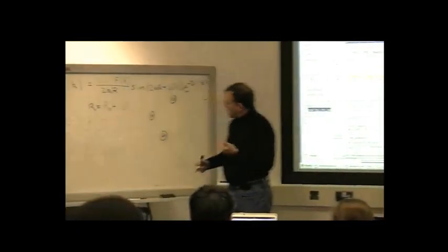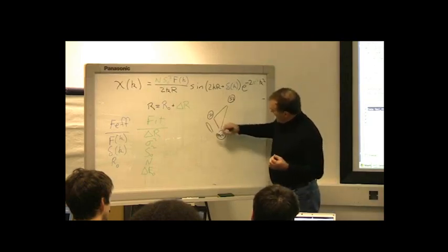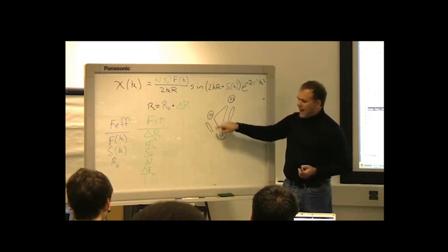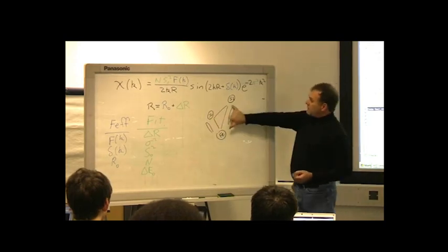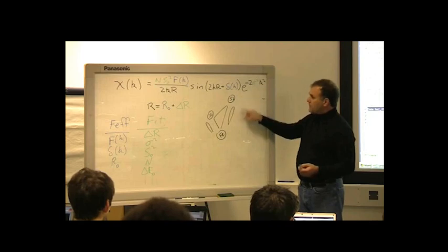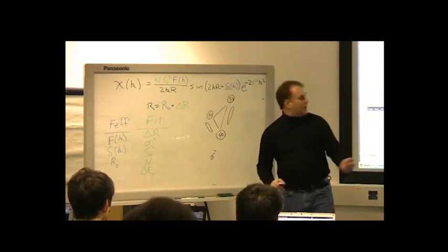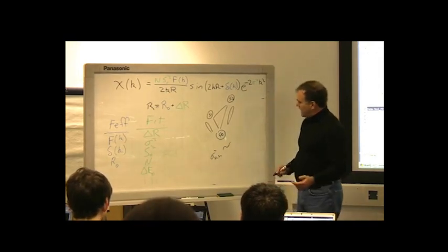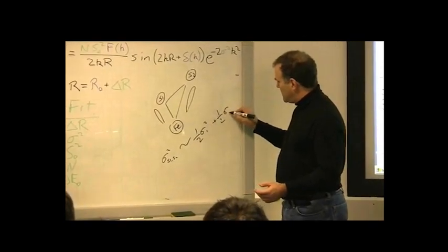But my point is that a path that does that has a certain resemblance to this single scattering path and this single scattering path. That is, the mean square deviation in this leg of the path must be somehow related to the mean square deviation in the single scattering path that hits the first shell sulfur atom. Similarly, the mean square deviation in this leg of the path must be somehow related to the mean square deviation in the single scattering path that hits this sulfur atom. So, in some hand-wavy way, the sigma squared of the S1, S2 path must somehow be related to this.